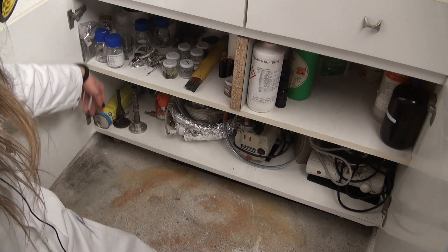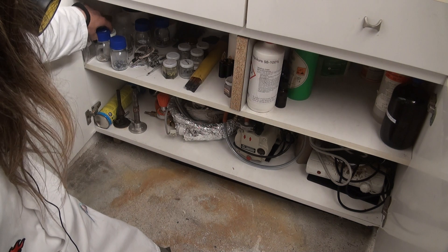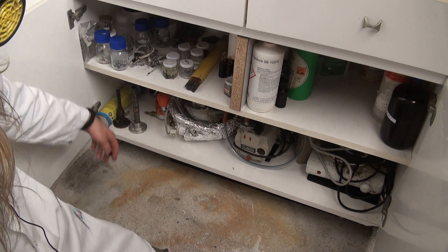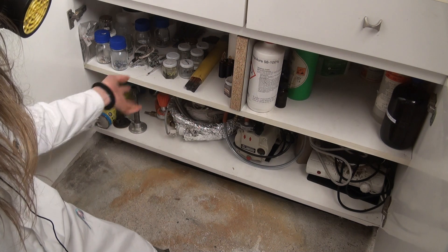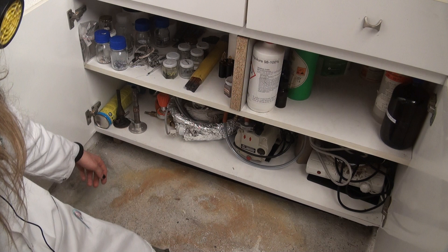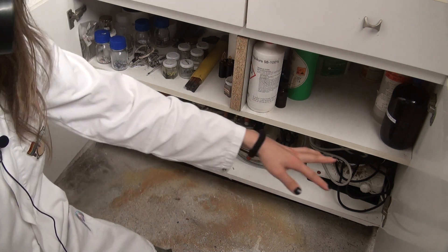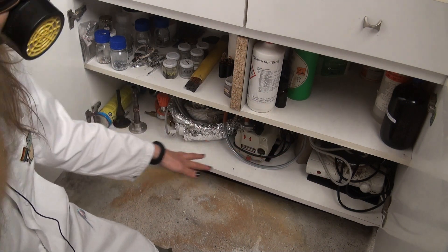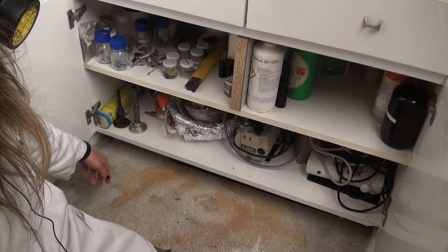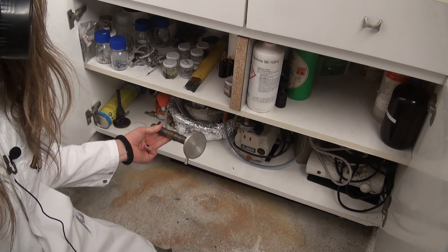And on the left here I have my elemental collection — chrome, silver, mercury, a whole lot of fucking mercury, iodine, bromine, gallium, carbon, sulfur, bismuth — pretty much everything you can think of. And down here is just some heating mantles, vacuum pumps, and also a few gas burners.